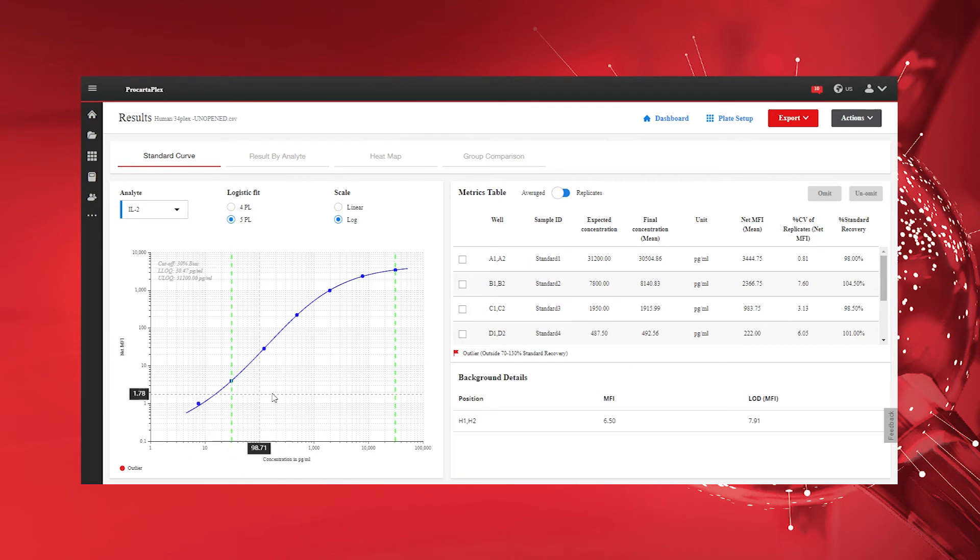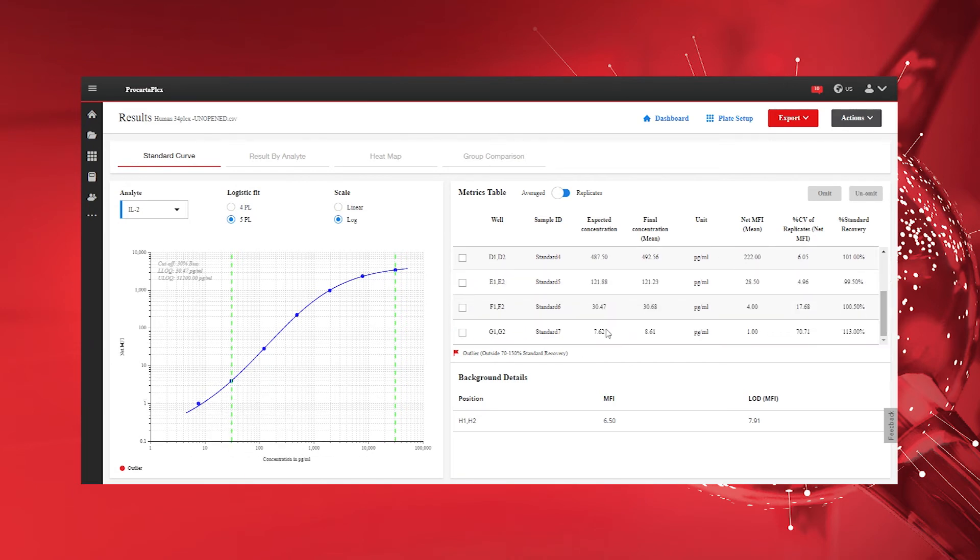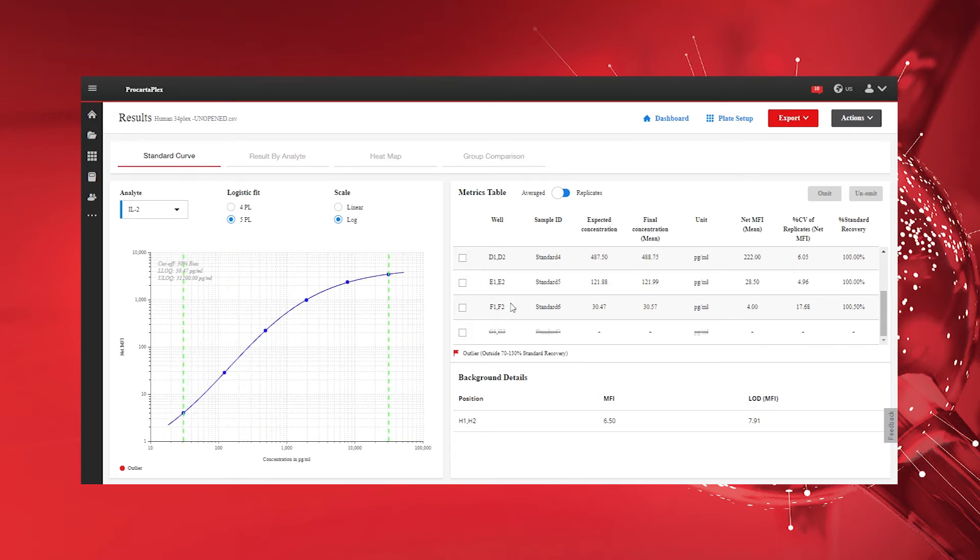Standard points can be removed from the Standard Curve calculation by clicking the checkbox in the Metrics table, followed by clicking the Omit button.